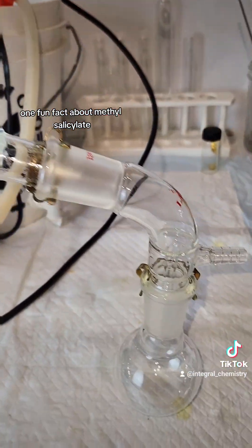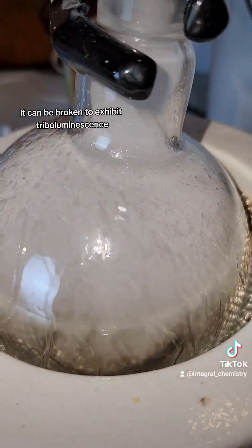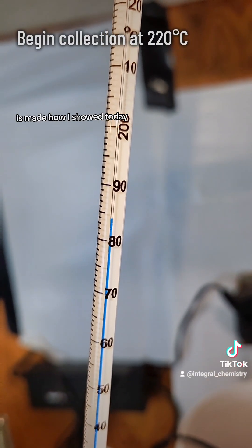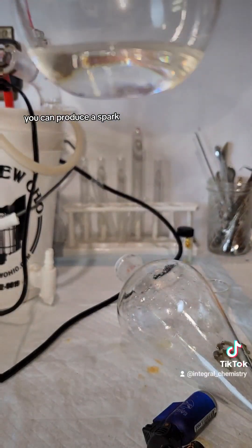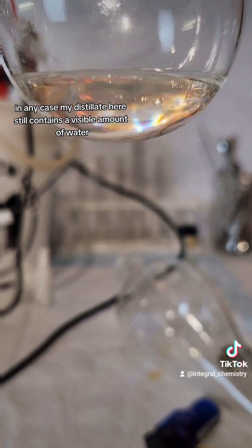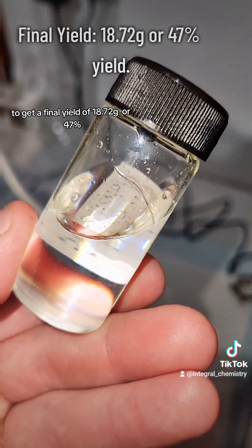One fun fact about methyl salicylate is that when it's mixed with sugar and dried, it can be broken to exhibit triboluminescence. Since all wintergreen produced for use in food products is made how I showed today, this is actually why if you bite a mint lifesaver hard enough you can produce a spark, which I figured you guys might find interesting. My distillate here still contains a visible amount of water, so I distill it again to get a final yield of 18.72 grams, or 47%.